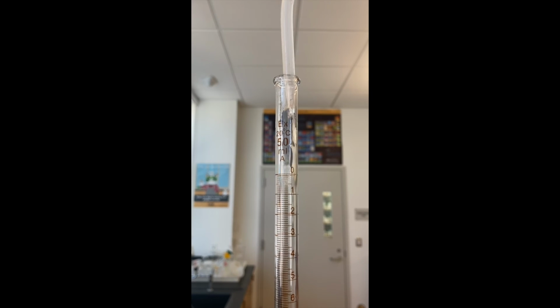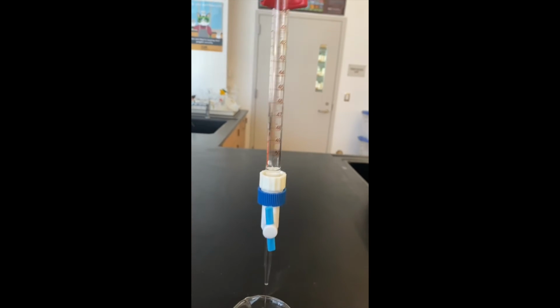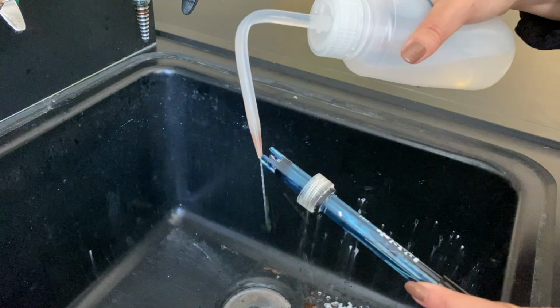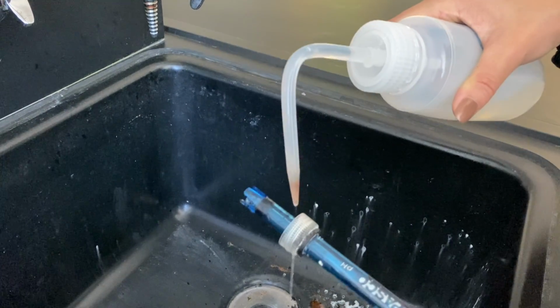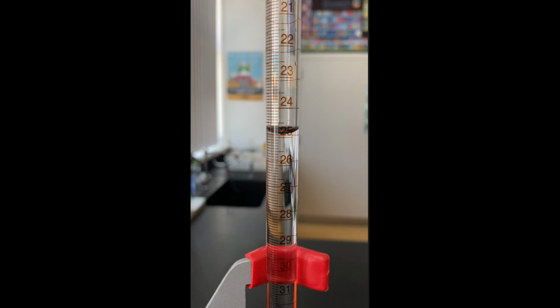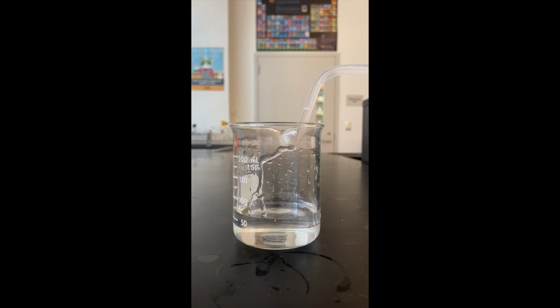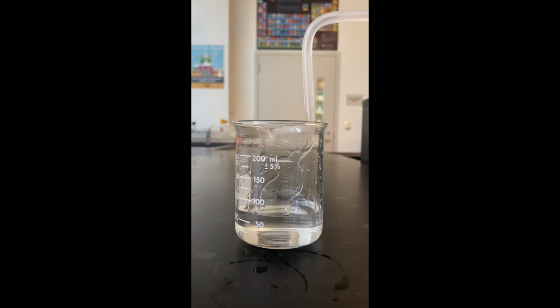Clean and rinse the burette before beginning to ensure that any substance besides the titrant has been run out. Rinse the pH meter with distilled water before using it to measure the pH after each increment of titrant is added. Be sure to measure from the bottom of the meniscus of the burette so as to minimize error when you do your calculations later on. If titrant gets on the side of the beaker, it is okay to rinse it off with distilled water, as the addition of the water does not affect the system reaction.